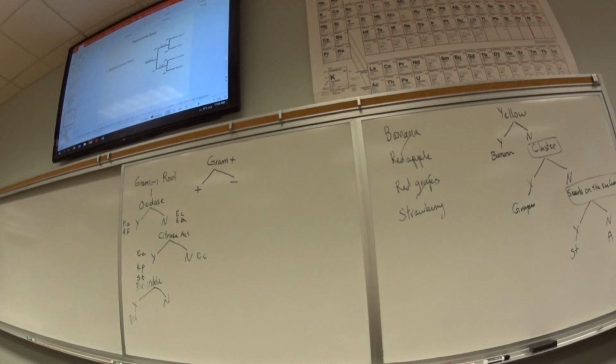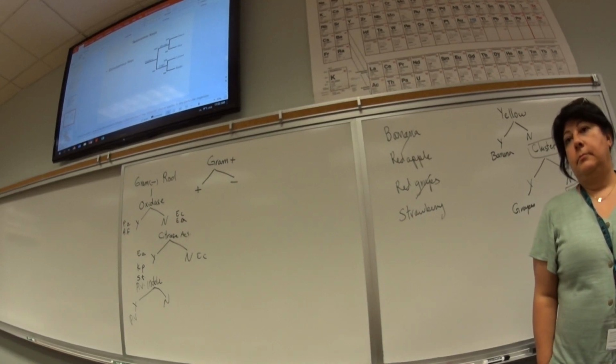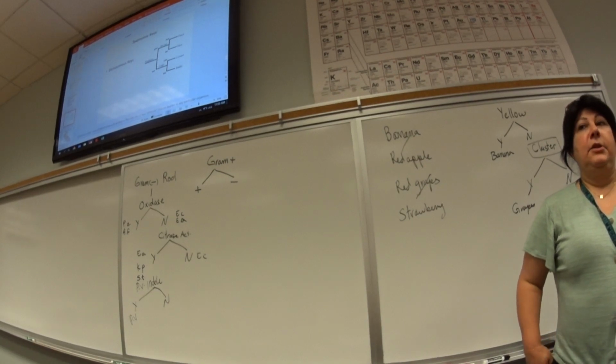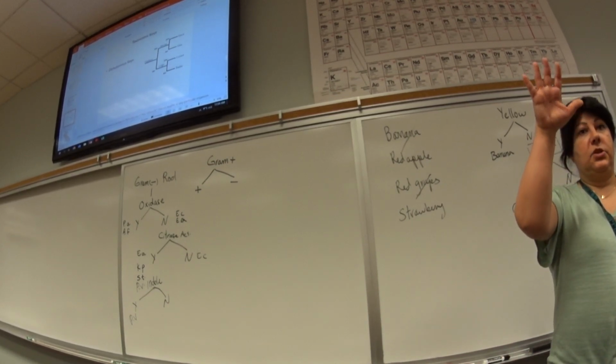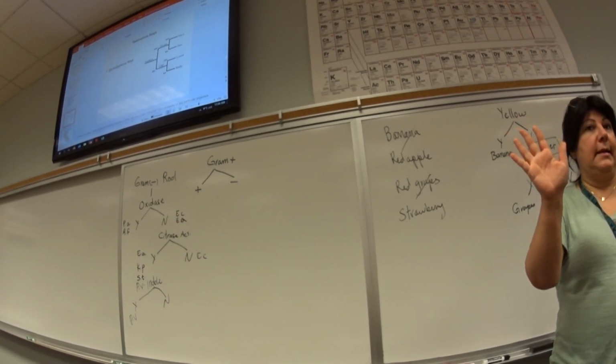Would you like us to add pictures in our results for our everyday reports? You don't have to. Okay. Some people like it. Those are like your little preferences. Some people right away when they have unknown number 5, take a picture of the slant or their streak plate. But tables are more than enough for me. How you want to write it, you'll see from the reports that I have.